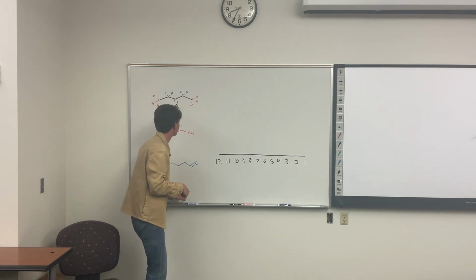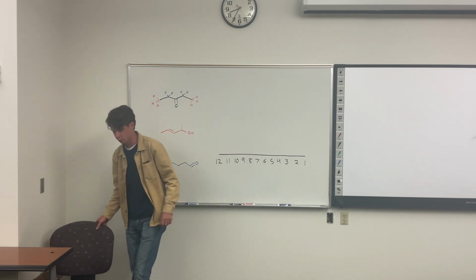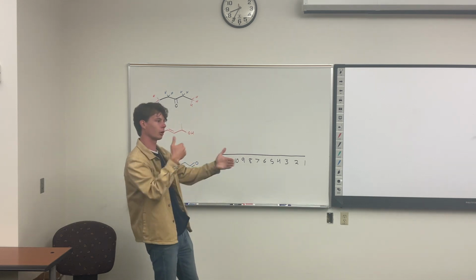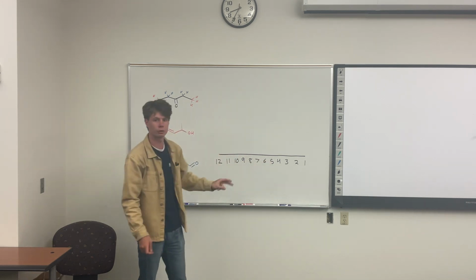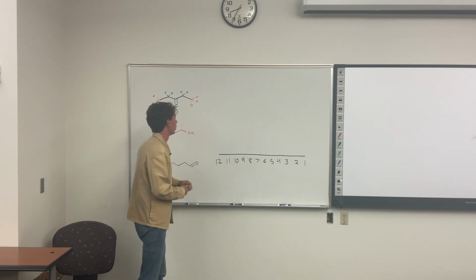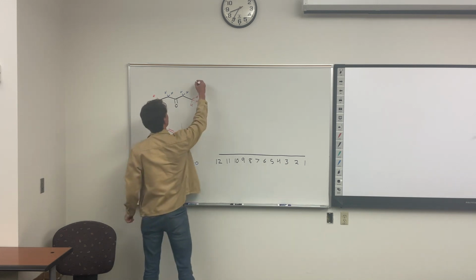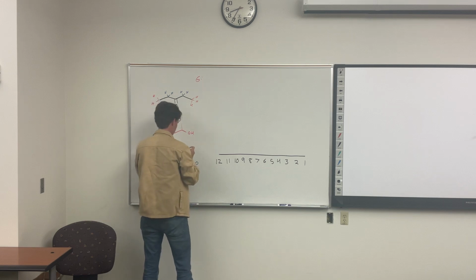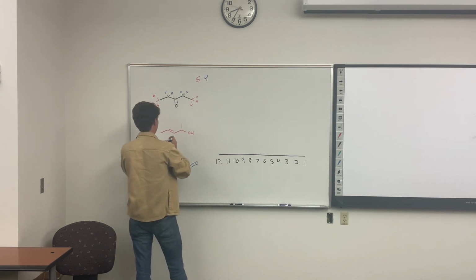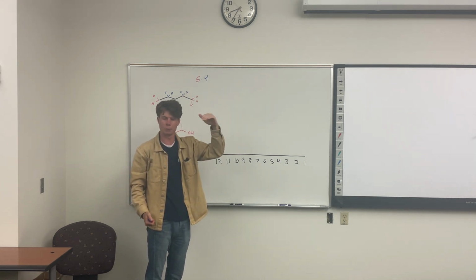Lines of symmetry, okay? So I should only expect to have 2 peaks in my HNMR. Now those peaks might split and they might be different intensities, and they're also going to vary in orientation, but I should expect 2 groups. Intensity with HNMR lines up perfectly with how many hydrogens we have. So we have 6 red to 4 blue. So we should expect, on a 3:2 ratio, or 6:4, our red peak to be 50% taller.